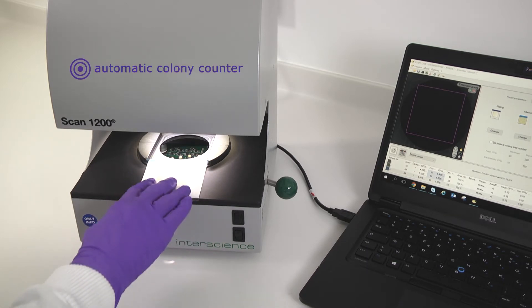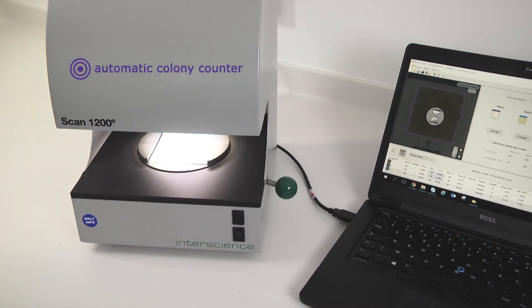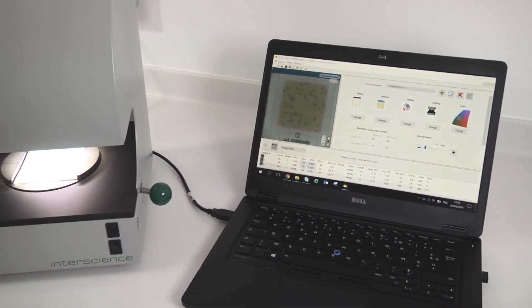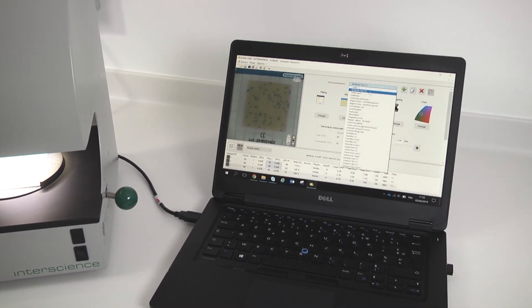The MC MediaPad is also compatible with automatic colony counters. Please refer to the colony counter manual for the specific procedure.